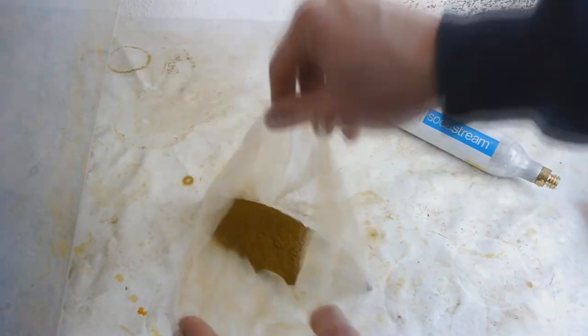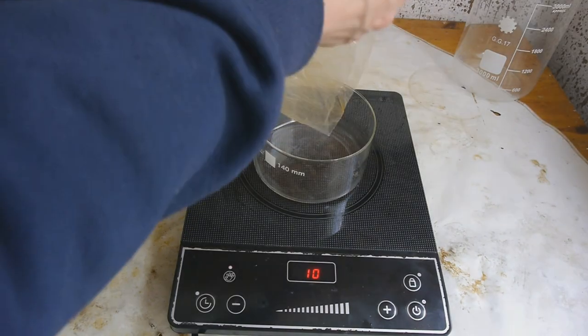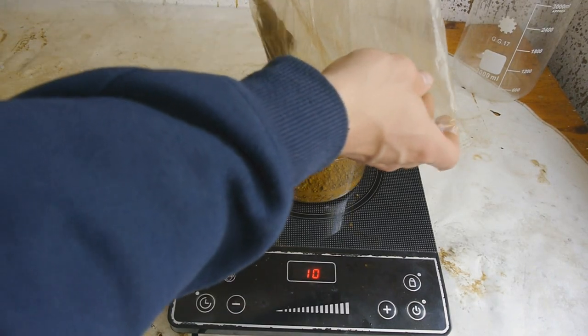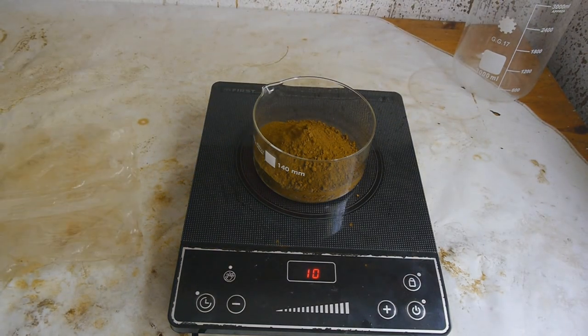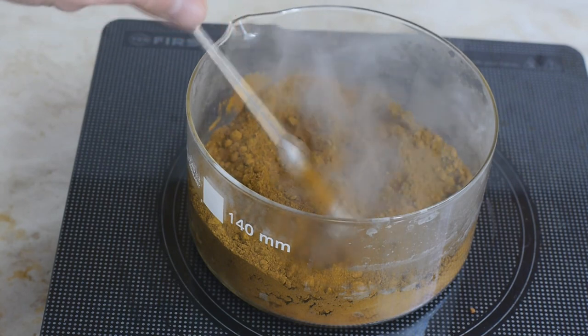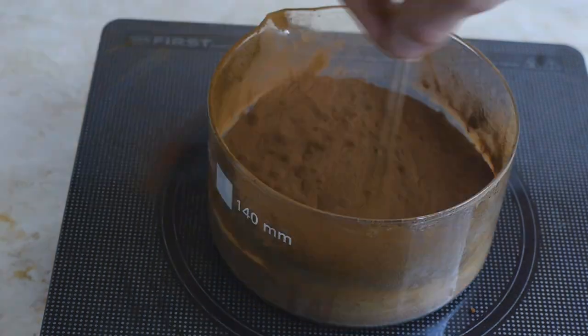And once it's reasonably fine like that, we will put it on a hot plate that is set to maximum heat. And hope that this will turn it into the real iron oxide, Fe2O3. You can see that there's water vapor coming off now, which is a good sign. It's looking quite fascinating. And the color should also get more red now.